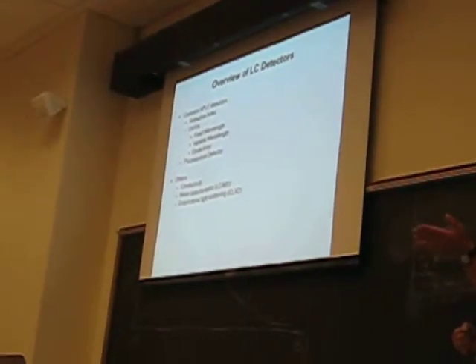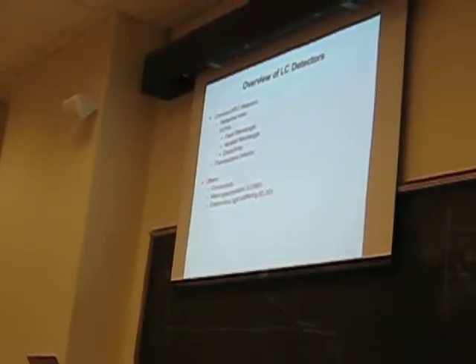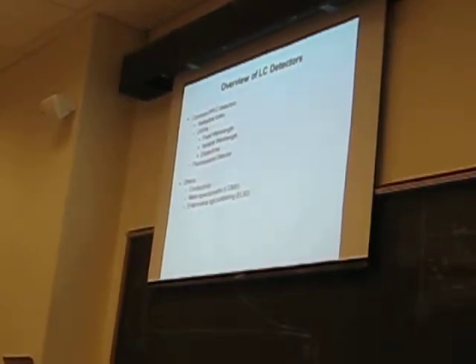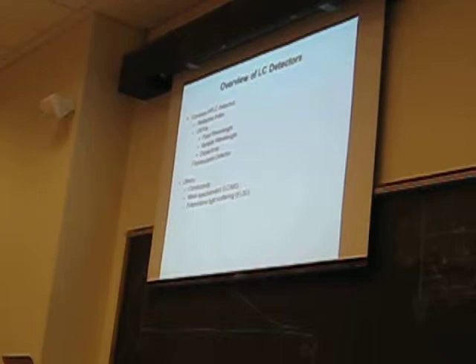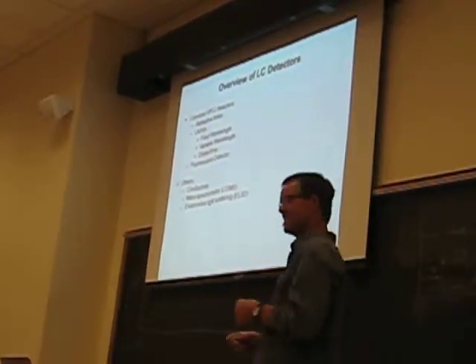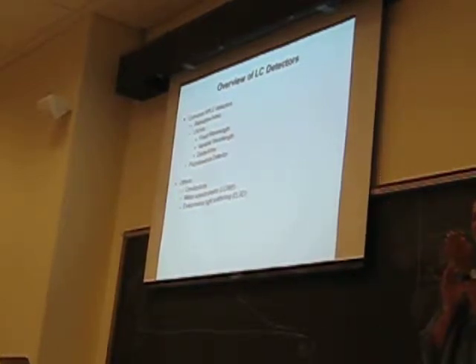So in yours, your detector is measuring what in your system? The ion. Okay, so it's measuring, this is actually kind of a trick question maybe. Resistivity. Resistance? Impedance. So what is the detector? What kind of detector is your detector? It measures the inverse of conductance of AC current.